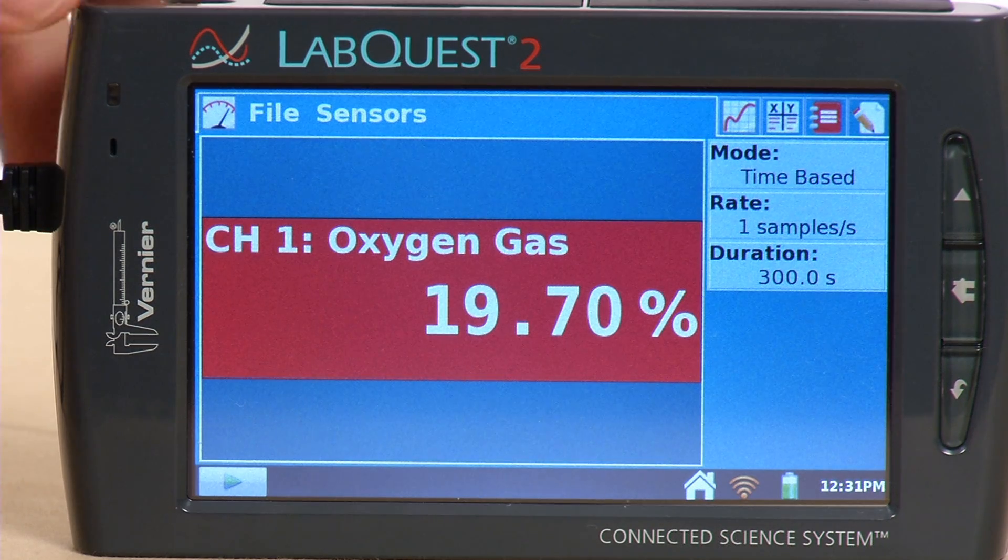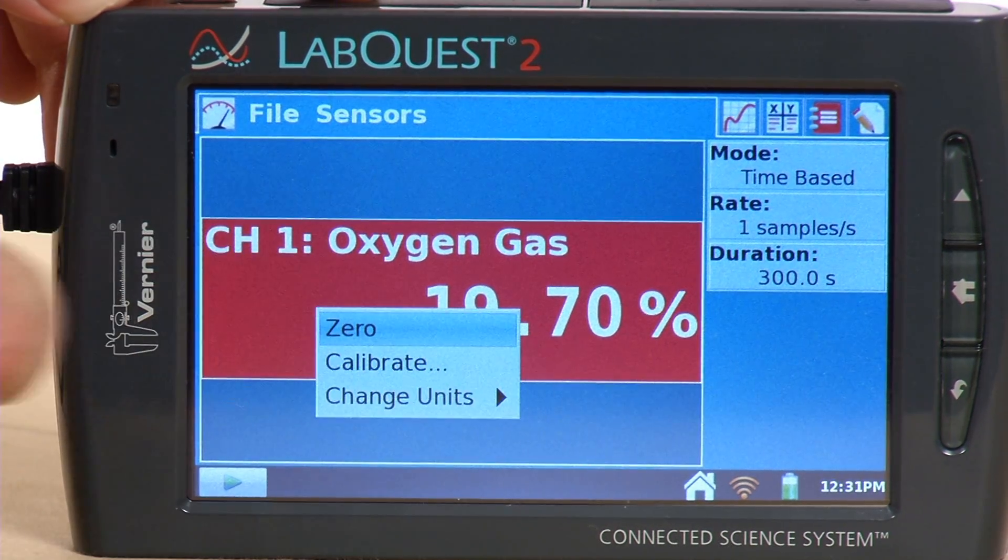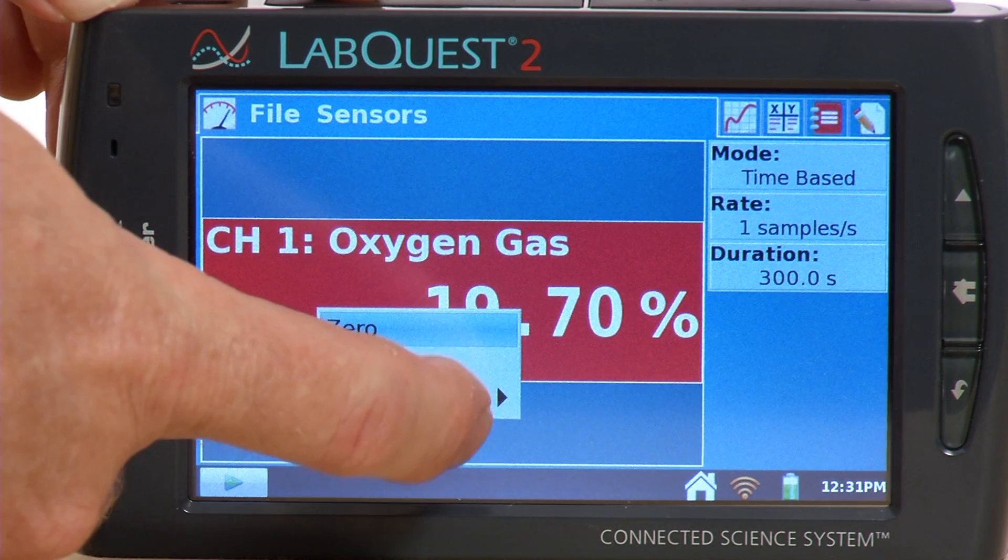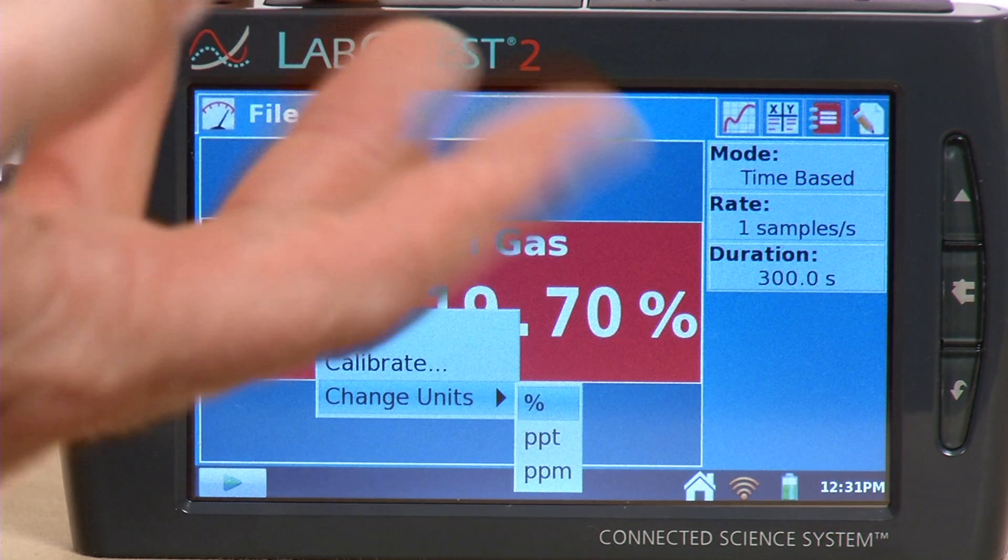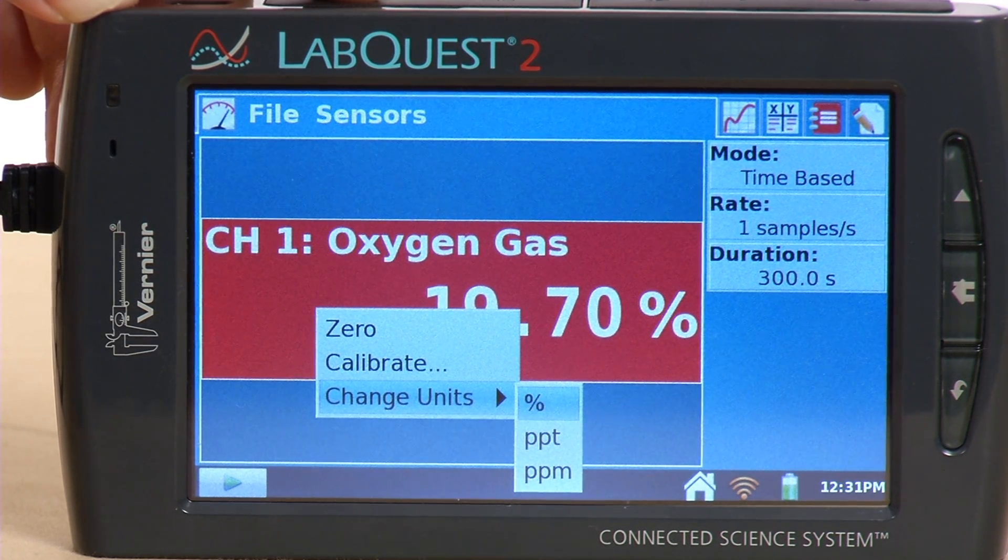If you wanted to change those units, it's easy to do. You tap on the meter itself. You can go and do change units if you would like. So I could do parts per thousand, parts per million, or percent. I'll just leave it like it is here.